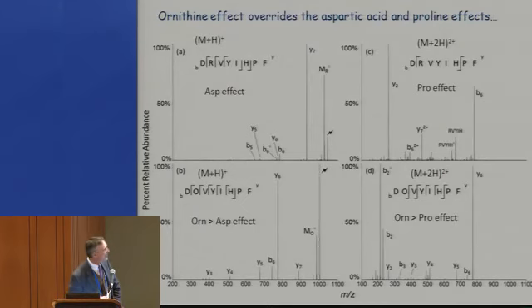Then we were interested in how strong the ornithine effect is relative to the aspartic acid and proline effects. People are familiar with those favored cleavages under certain conditions for peptides. Here's aspartic acid, so it has the opportunity for the aspartic acid effect. It also has an opportunity for the proline effect.